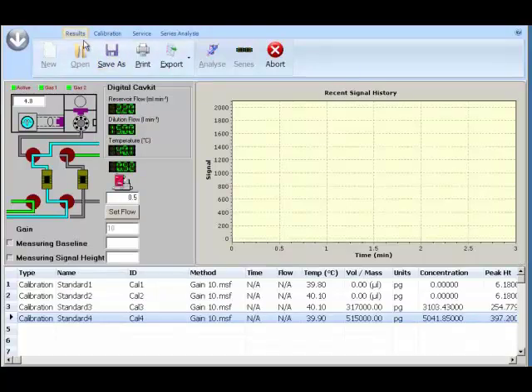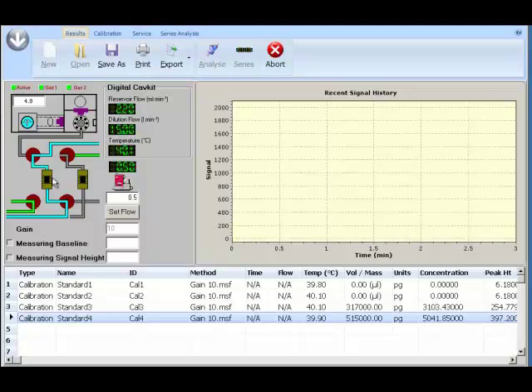On the results page you can see the sample collecting then analyzing. It records the temperature and the volume that you can see in the results page.